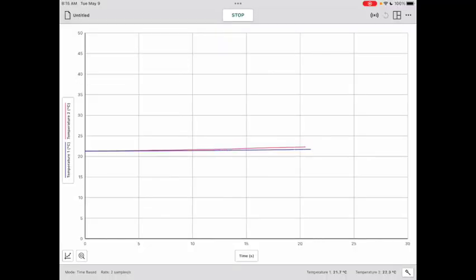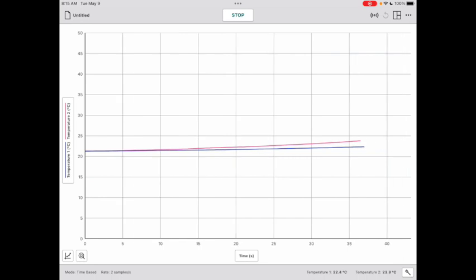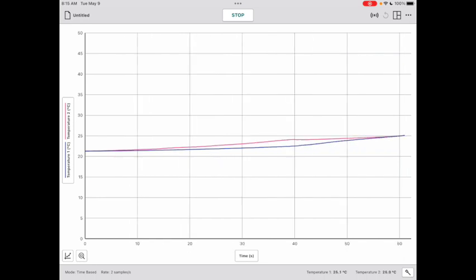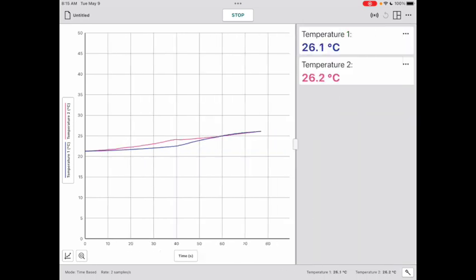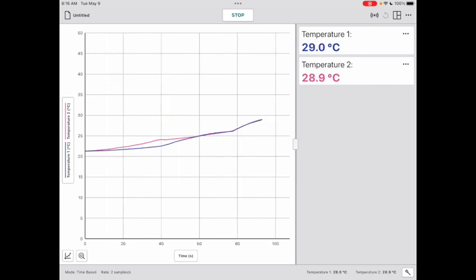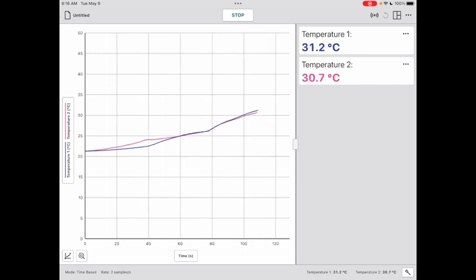Here's what the temperature looks like. I'm going to let this run for about five or six minutes. We're going to speed this up because we don't want it to take forever. Both of the solutions are increasing their temperature at about the same rate.